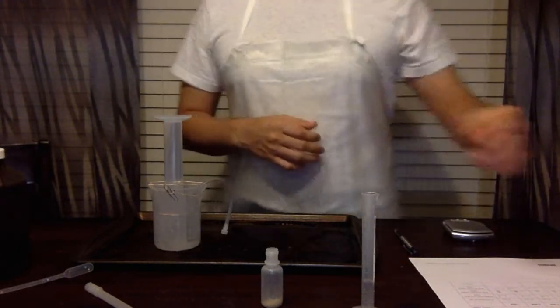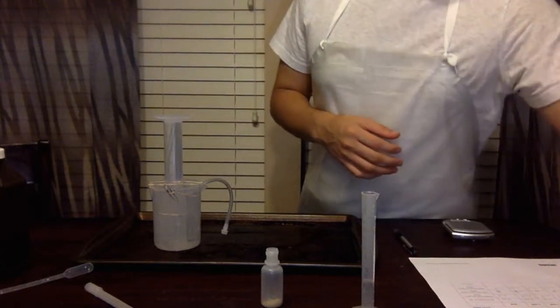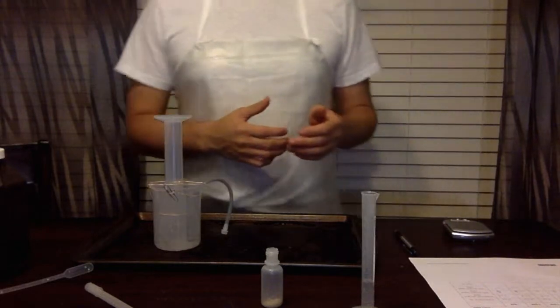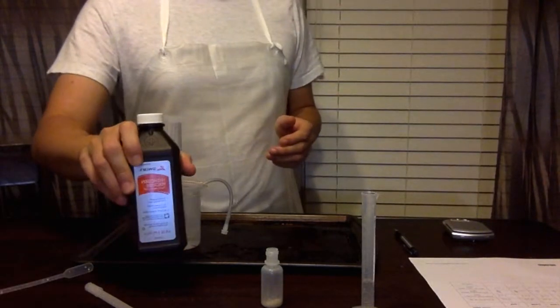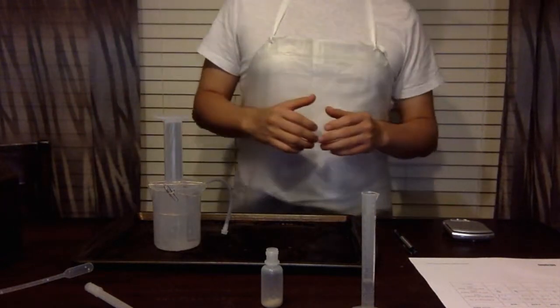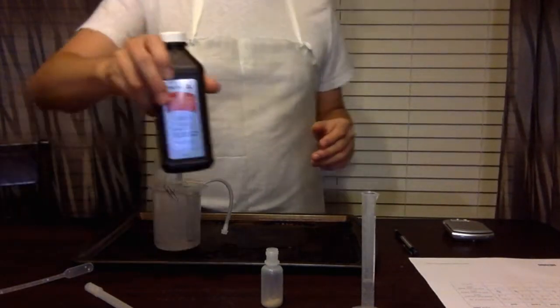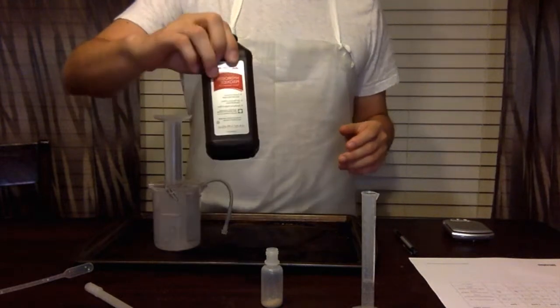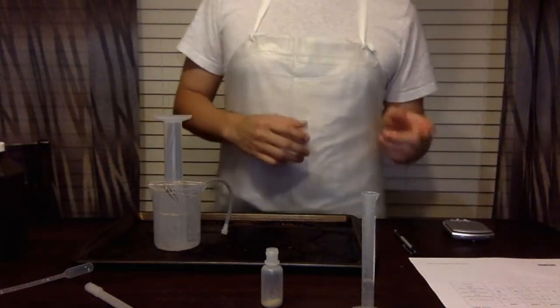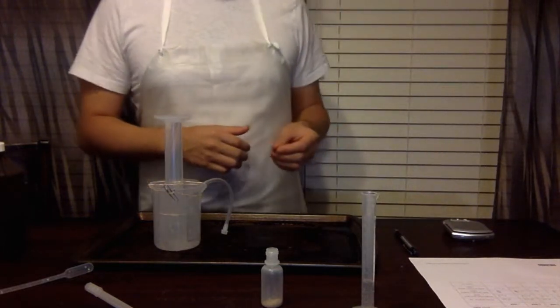Let me just give you some brief background. We will be using yeast as a catalyst to our hydrogen peroxide decomposition. So the purpose here is to try to extract the O2, or oxygen, out of the hydrogen peroxide, and we're going to use yeast as a catalyst to speed the reaction up.